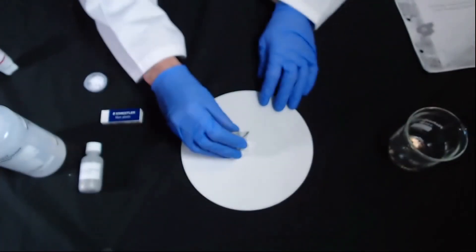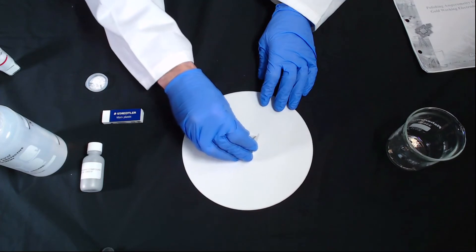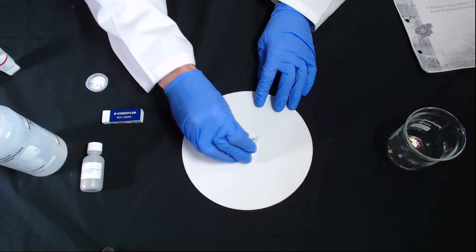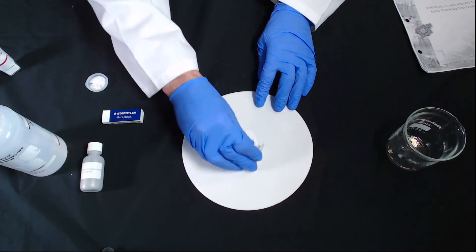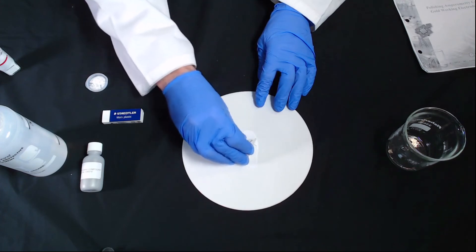What we're going to do then is just polish for around five minutes. It's good to polish in a figure of eight like this. We would do this for about five minutes, and that's going to polish the electrode.